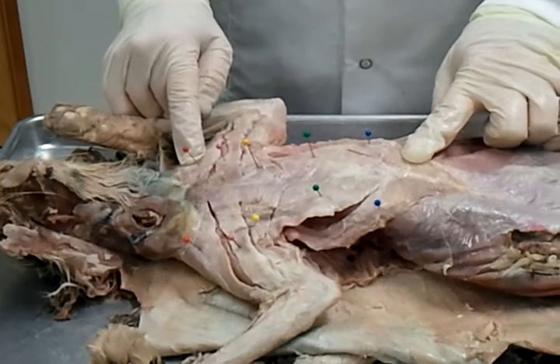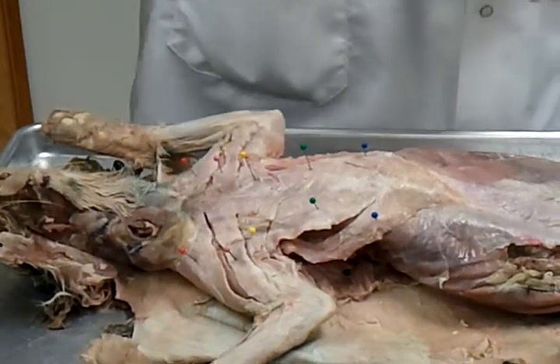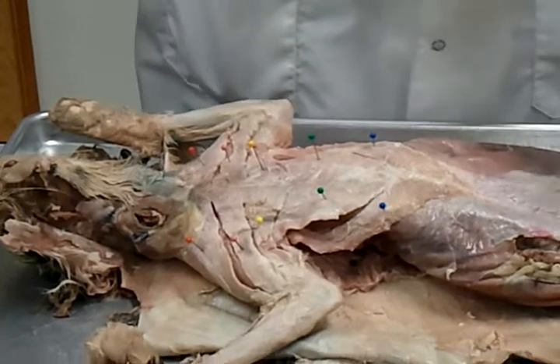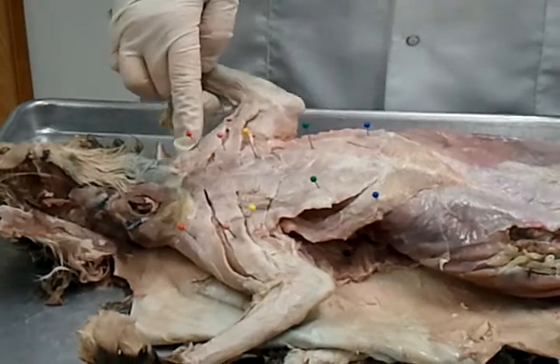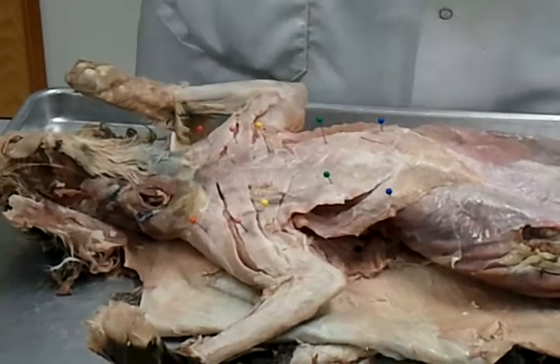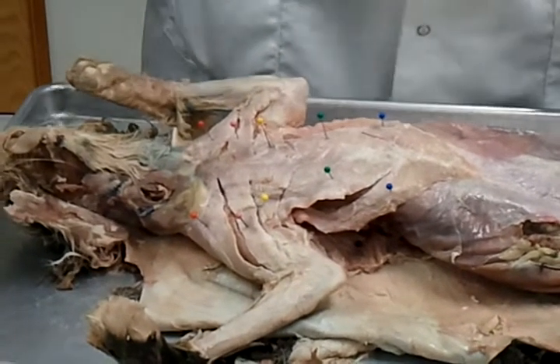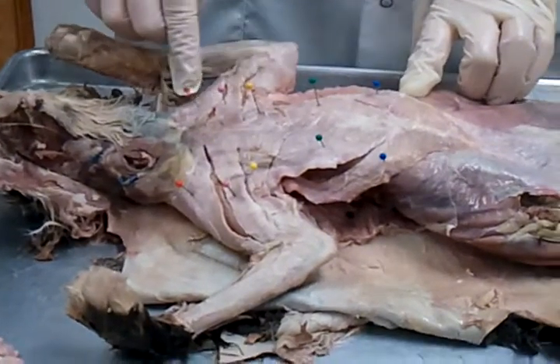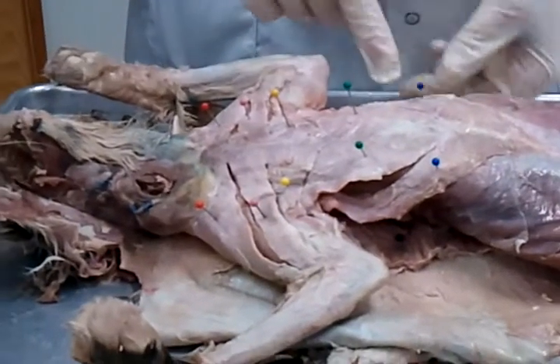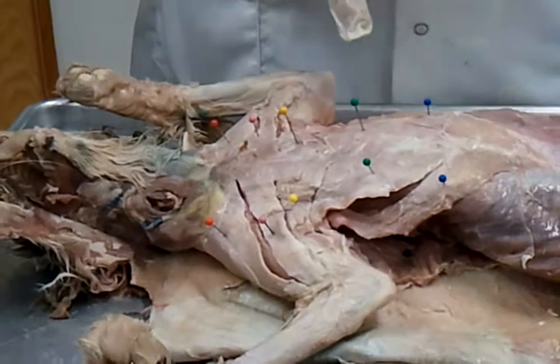Pectoantebrachialis, and this one on top of the shoulder is a bunch of muscles called a deltoid. It's the first of them. It's the collarbone deltoid, the clavodeltoid. Sometimes people call it the clavobrachialis, because in cats it comes all the way down to their elbow, not in humans. Okay? So you want to recognize those 5 in a row, plus the latissimus dorsi on your cats.